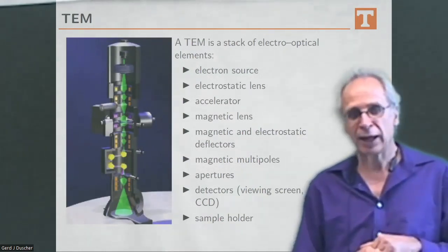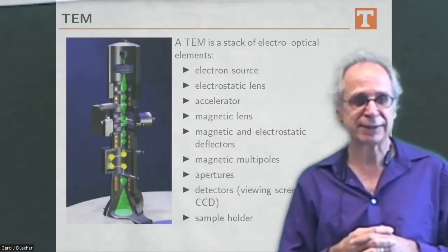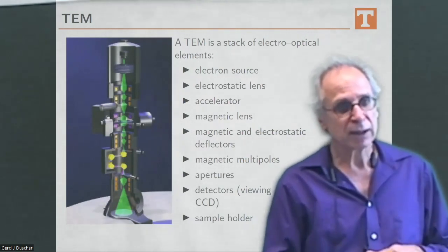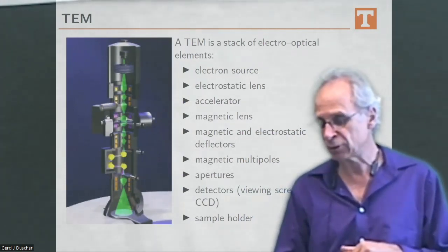We are actually only interested in how much in the STEM arrives at the sample in what small diameter, and that is called brightness. So we are interested in brightness, and we are interested in the energy distribution within this electron beam.